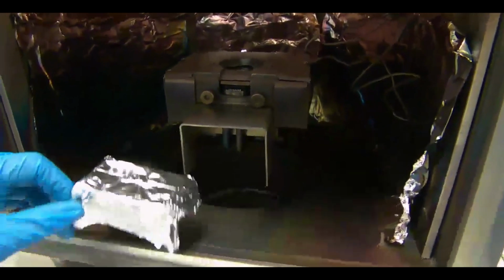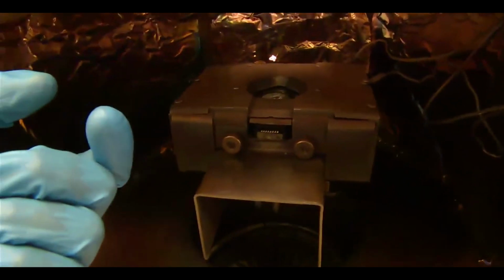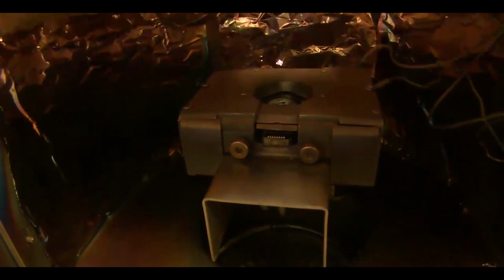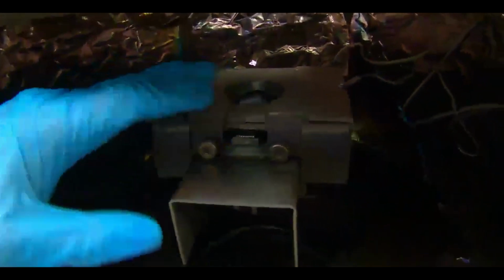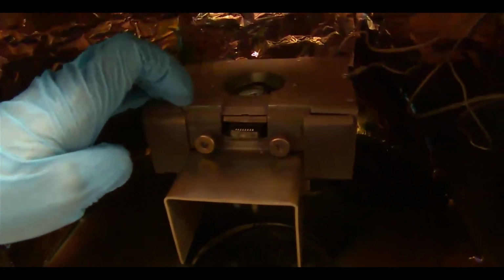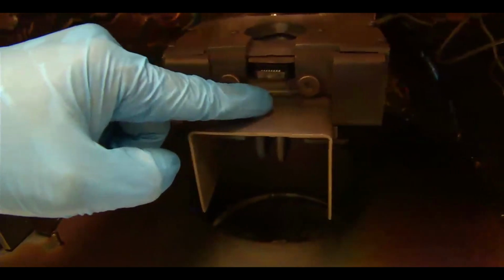So here you can see there's a filament, looks like a light bulb. It's a tungsten wire-wound filament. You put current through it, on the order of 20 or 30 amps, to light that up and produce free electrons in the vacuum. So there'll be a cloud of free electrons, just like in a light bulb. But then we need to drive the electrons away from the filament. So we drive the entire filament up to 10,000 volts. So the electrons will be spraying out of here.